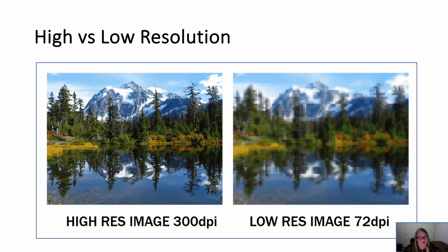One of the things we have to remember is that magnification and resolution work together. They're interconnected. Think of how you take a picture on your phone. Our phone cameras are rated by pixels, and pixels are the resolution of our cameras. If we take a picture and zoom in on a specific part of that picture, there comes a point where, as we magnify it, it goes blurry and pixelated. When we get to that part, we have gone past the resolution of our camera, and it can no longer distinguish between different objects, which is why it becomes blurry.